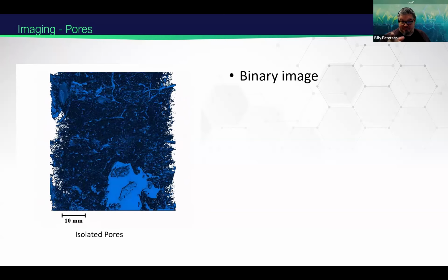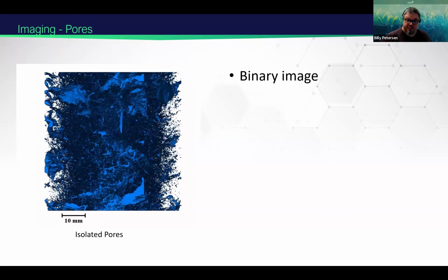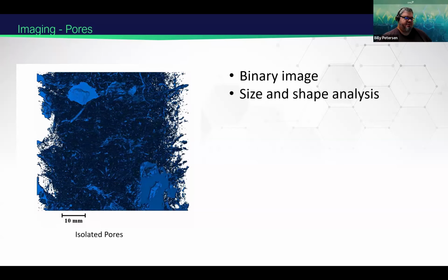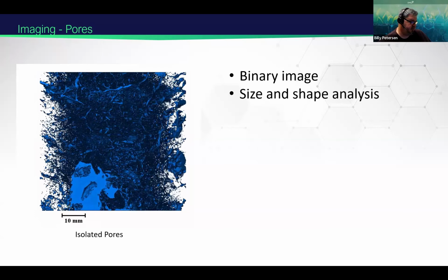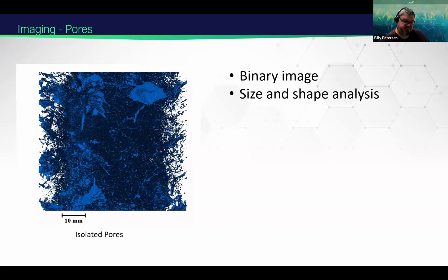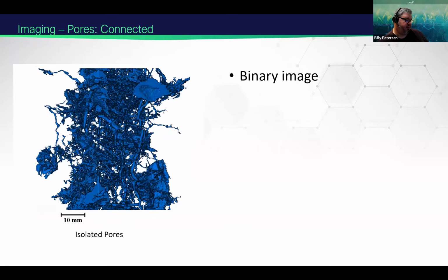And going over what I just did for your cores is related to that, because it's using connected pores, so not overall pores, but just connected pores. Once again, it's pretty simple. It's the size and the shape, and based on that is what Aviso does the analyses. To us, it looks like a blob on the screen with some hair coming off of it, but in Aviso it's measuring voxel size and converting it, so we're getting a really good measurement of the pores themselves.